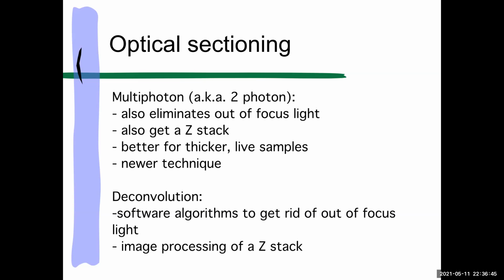So this was a way to get the light to penetrate more than 100 or 200 microns in, but even multi-photon says we can go down to 300 microns in, or something like that. And it's gentler. They're pretty finicky.